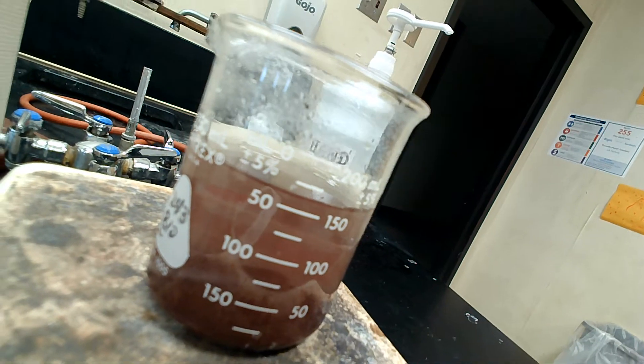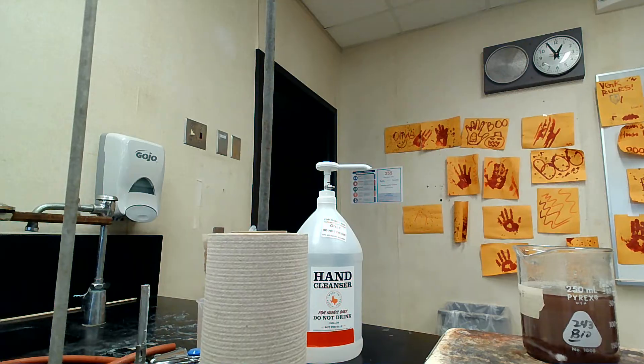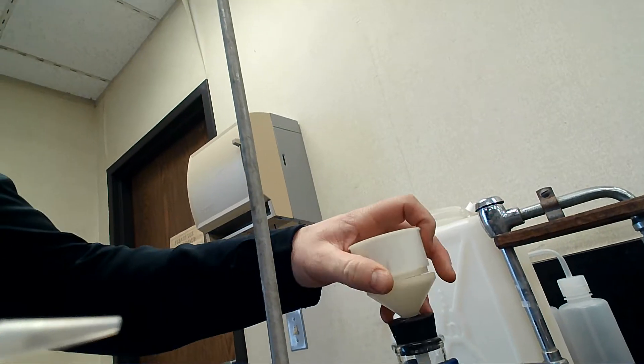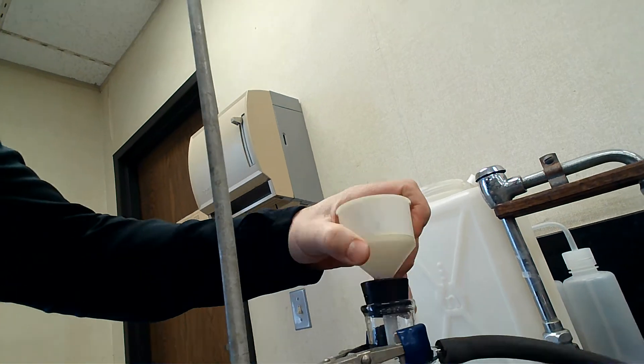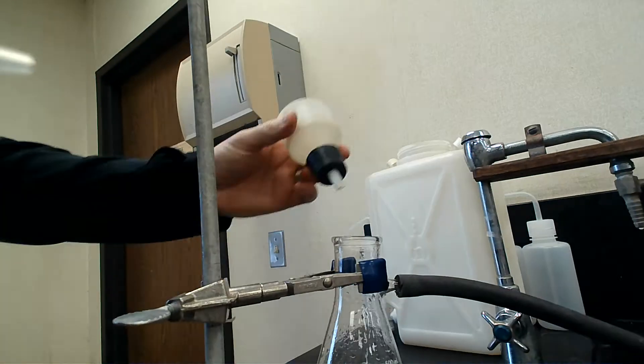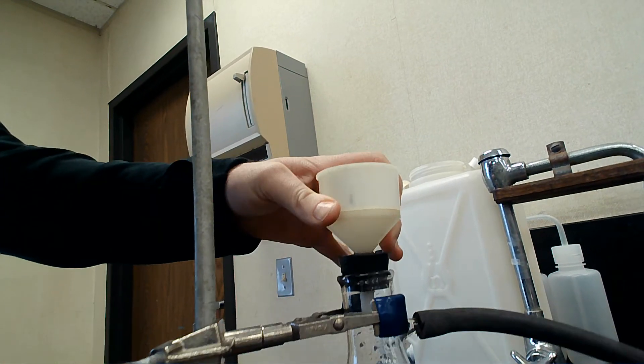We're going to go ahead and do our next step, which is vacuum filtration. Here's what we have: a Buchner funnel. Basically, it's a way to separate the solid from the liquid. We hook this up.